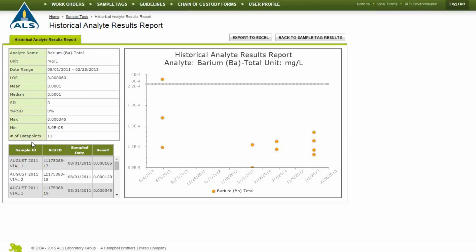Regulatory limits appear as lines on the graph and the regulatory names and limits will appear in the legend at the bottom of the graph. Click Export to Excel to export the graph as an image.